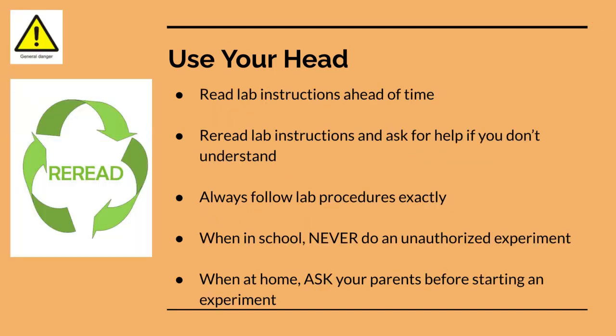Again, use your head. Read those lab instructions. A really good practice is reading them ahead of time. If you read them before you do anything, then you should have some understanding of what to expect. So be careful, read ahead. It's the same thing if you cook or bake at home. You read the recipe before you start so that you know what to prep, what you don't have to prep, what you can do on the fly, and what you should do ahead of time. It's the same thing.